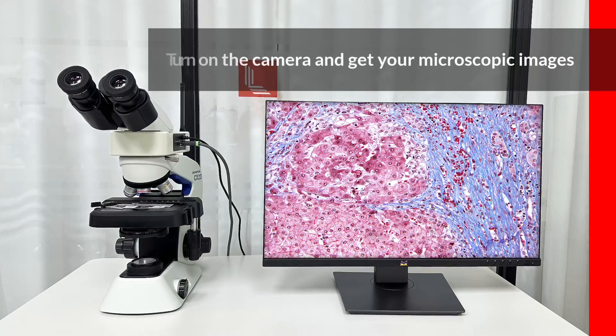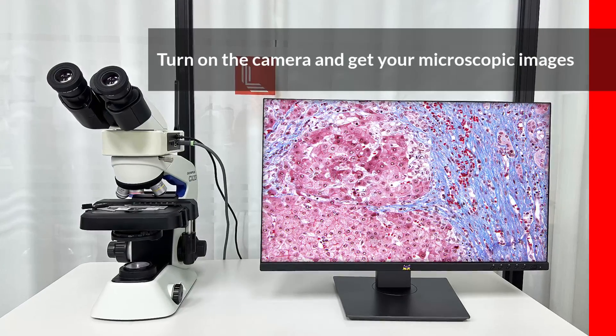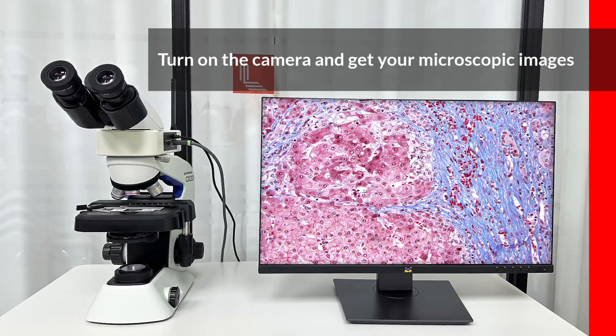Now we have got the camera installed on the Olympus CX23 microscope. Just turn on the camera and explore the microscopic world.